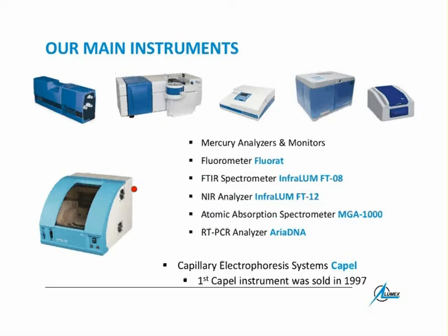So people ask the question, what about the reproducibility of the time? And there are rumors that this reproducibility is sometimes slightly worse than that of HPLC or any kind of chromatography. I want to address these concerns. The point is that everything depends upon the buffer which you use in the capillary.